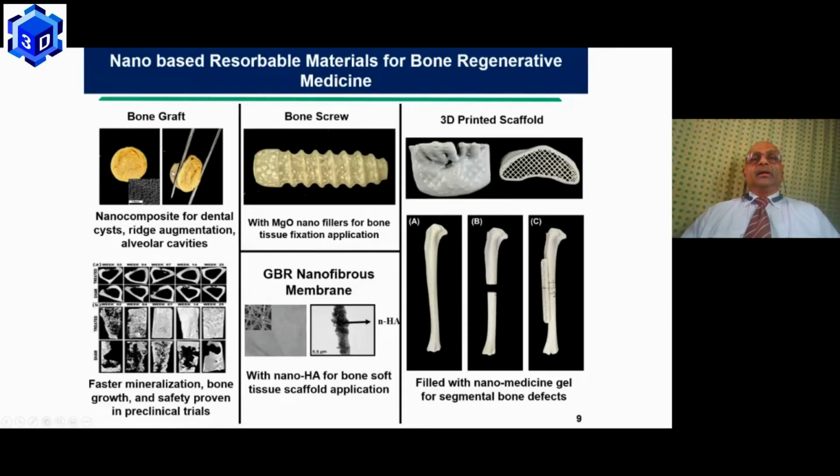This is a bone void filler essentially, and this can also be 3D printed, which is what I'll show you in a few minutes. This has excellent performance. You can see in a micro CT experiment where the standard of care, which is no graft at all, shows bone that is being laid and remodeled, but still being a critical defect. The body cannot bridge the defect, whereas the treated side builds up bone to a good density.